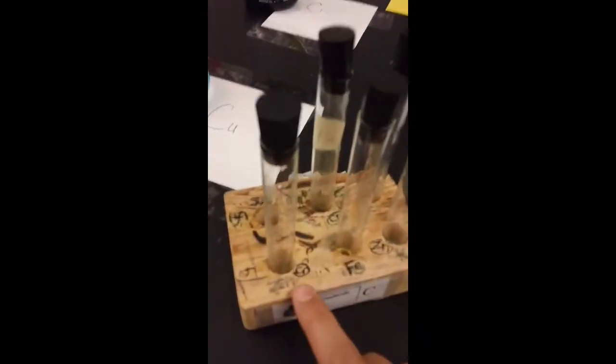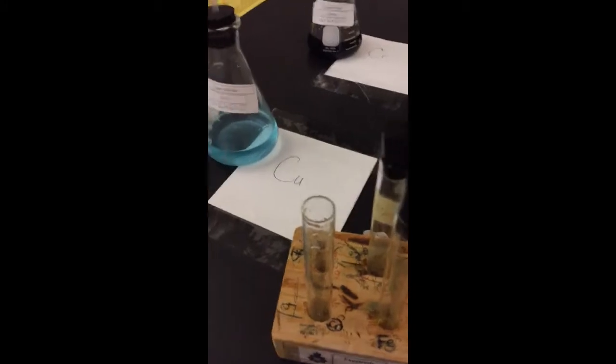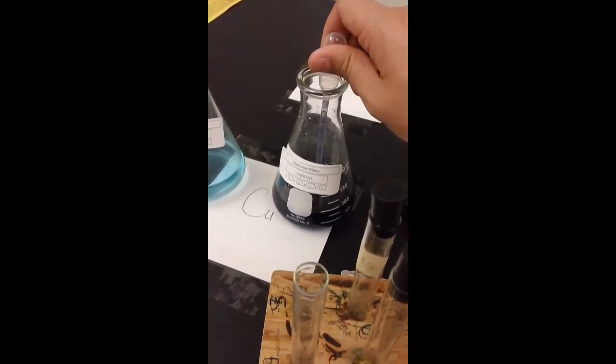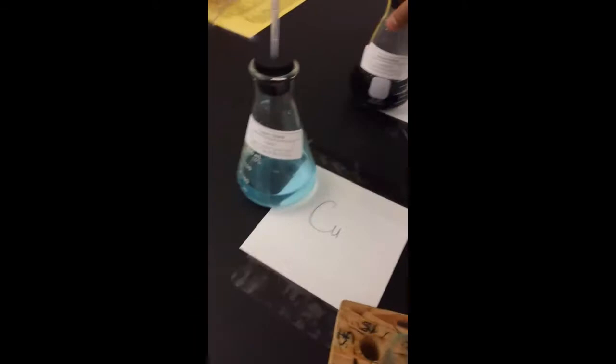Next, I want my Cr. Notice how it's labeled Cr. So here, sorry, working with one hand's a little challenging. So this is my Cr. If you'd like to make some observations of each of these chemicals before you run the tests, I highly suggest doing so. Okay, and we have Cr. Put my test tube stopper over there.